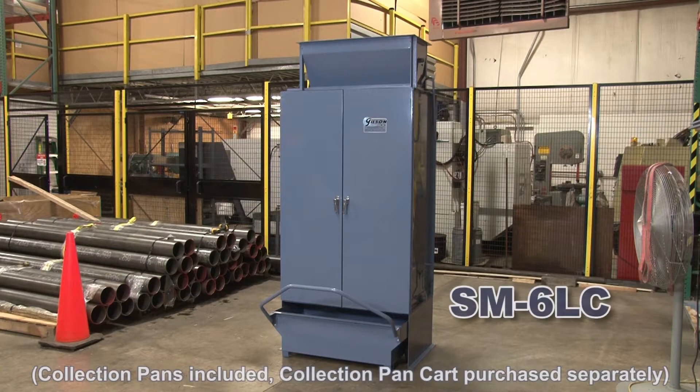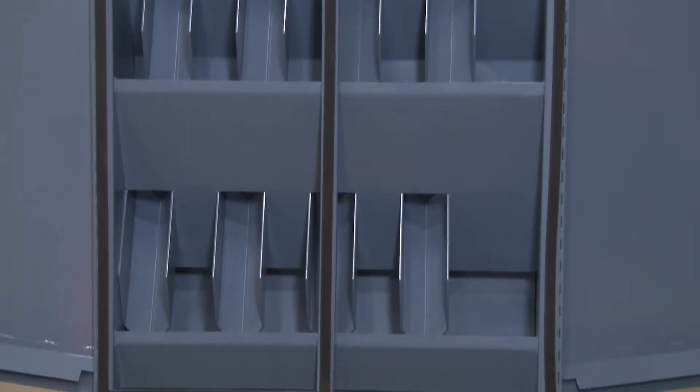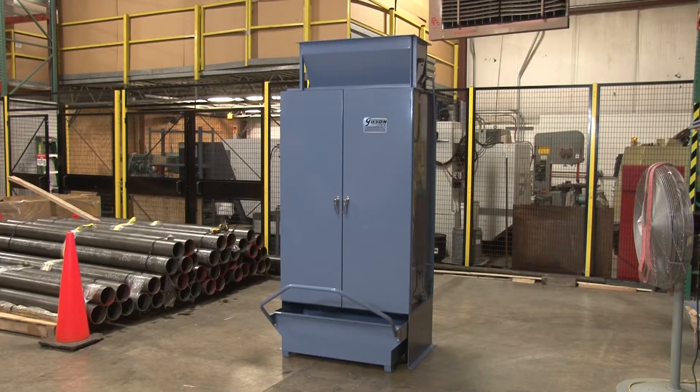Gilson's Laboratory Split-O-Matic splitters are a line of high-capacity laboratory splitters which efficiently reduce large bulk samples of granular material to one-half, one-quarter, or one-eighth divisions in a single pass.